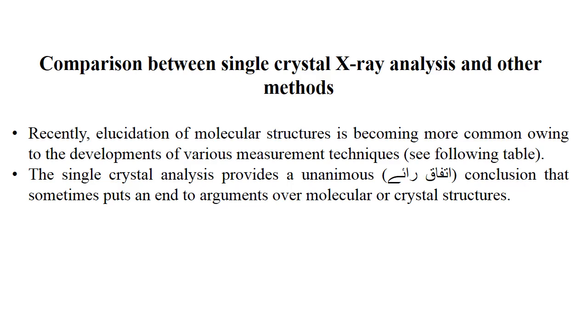On the other hand, it is the molecular structure itself that is derived from the single crystal X-ray analysis. Single crystal analysis provides an unanimous conclusion that sometimes puts an end to arguments over molecular or crystal structure.